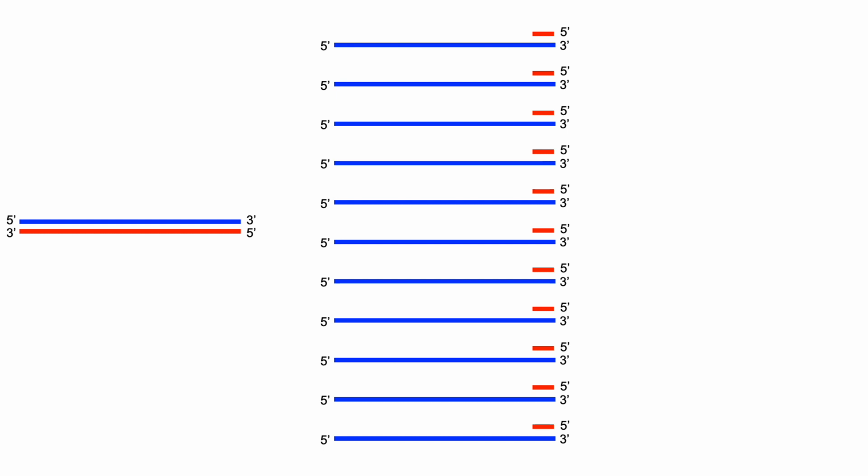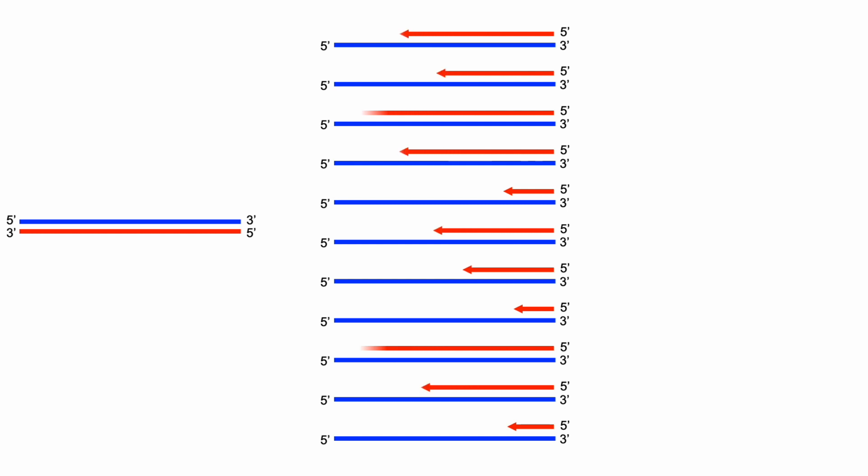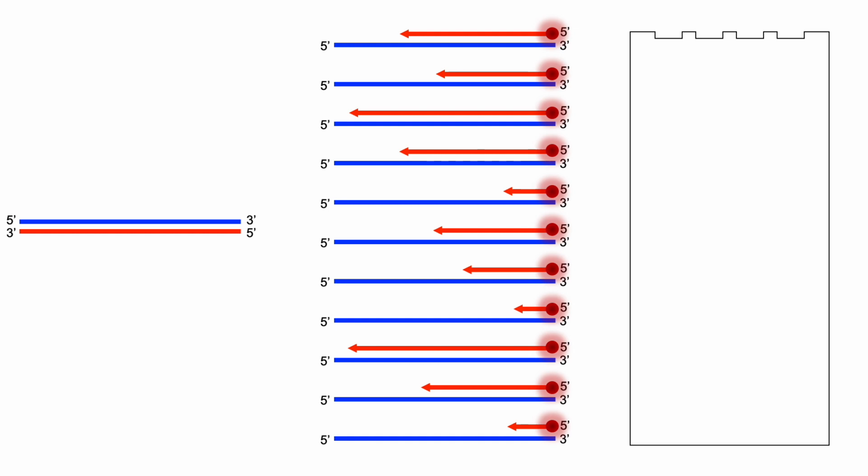We'll just run a little simulation here to see. The Taq polymerase will come and start to extend, and it's going to make all these different length products. And one thing to remember is that in the Sanger sequencing that we did, the primer itself actually had the fluorescent label on it. You can see right there, it's on the 5' end of the primer.